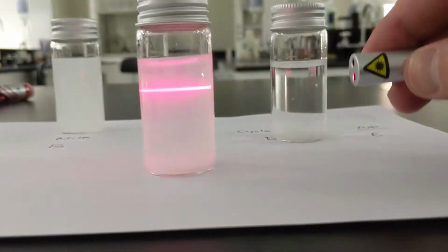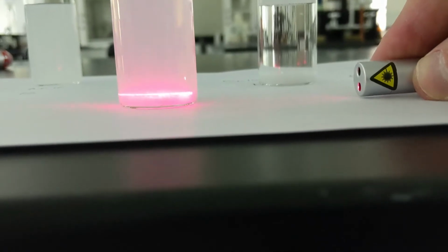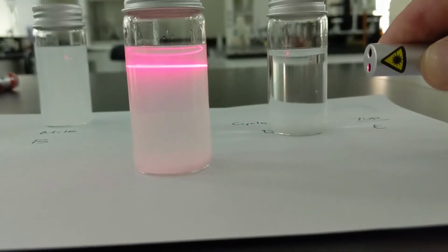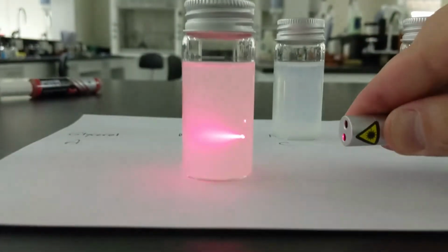And again, you can still see the difference between the top of this one and the bottom of this one. The bottom of this one, I can barely get my laser through it because there's so much solid, but at the top it becomes a little easier. And then milk, the same at the top, the same at the bottom. It's completely dispersed throughout this solution.